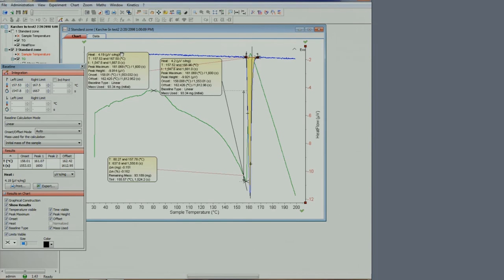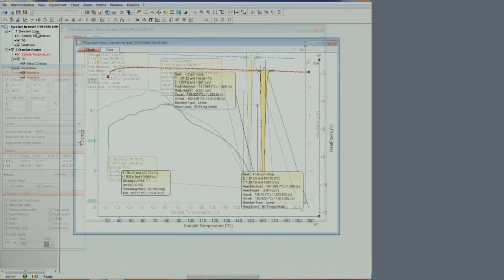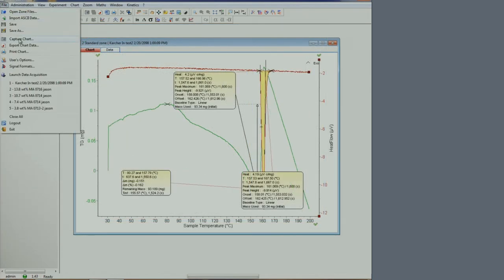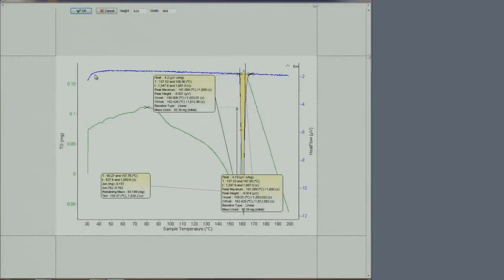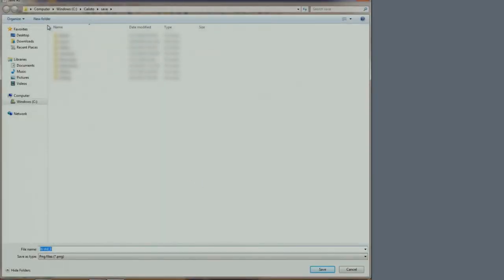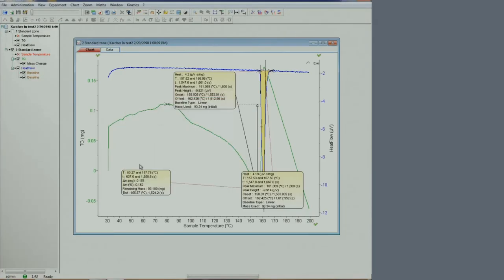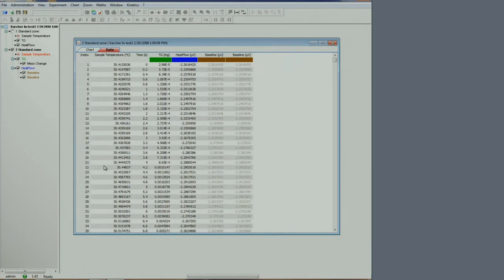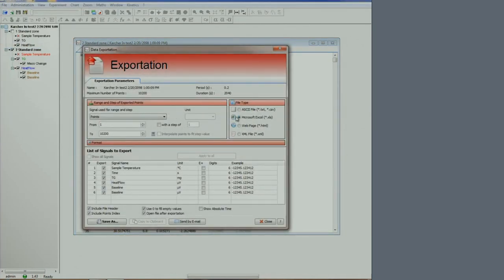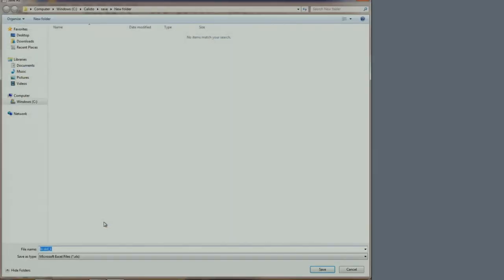Once the data is fully analyzed, one can capture the chart to generate a figure in the format of your choice. Save it as a file in your data folder. One can also export a data table by clicking the data tab and going to File Export Chart Data. A range of export formats is available. We typically select Excel format. Again, you can save it in your data folder.